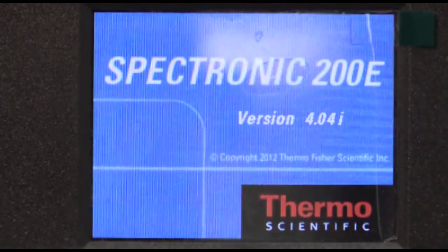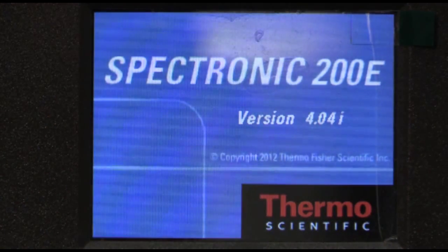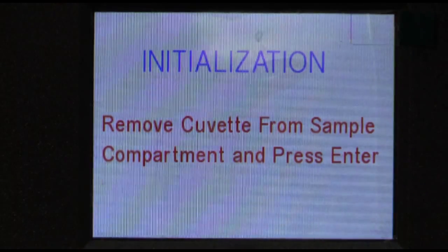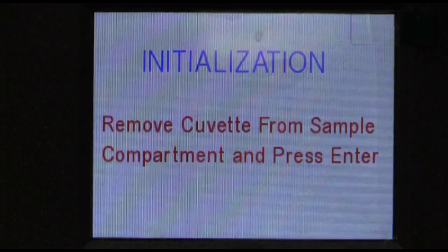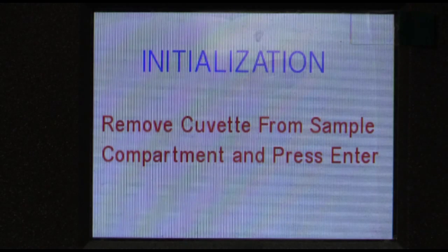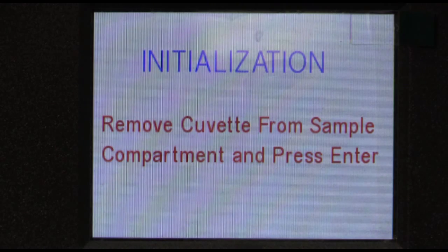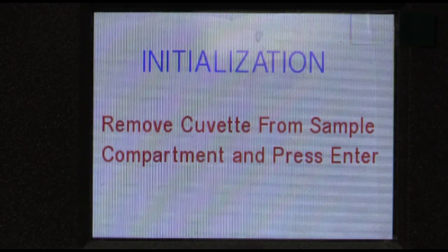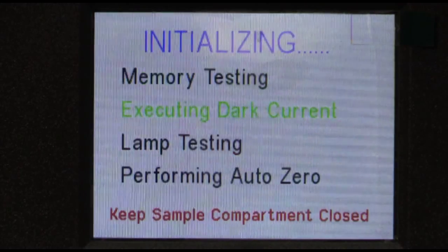First a startup screen will show, and this is the process of initialization, so follow the instructions on the screen. First it'll ask you to make sure that the compartment is empty. If it is not empty, empty it, and once it is, close the compartment and hit enter, which is this button here.